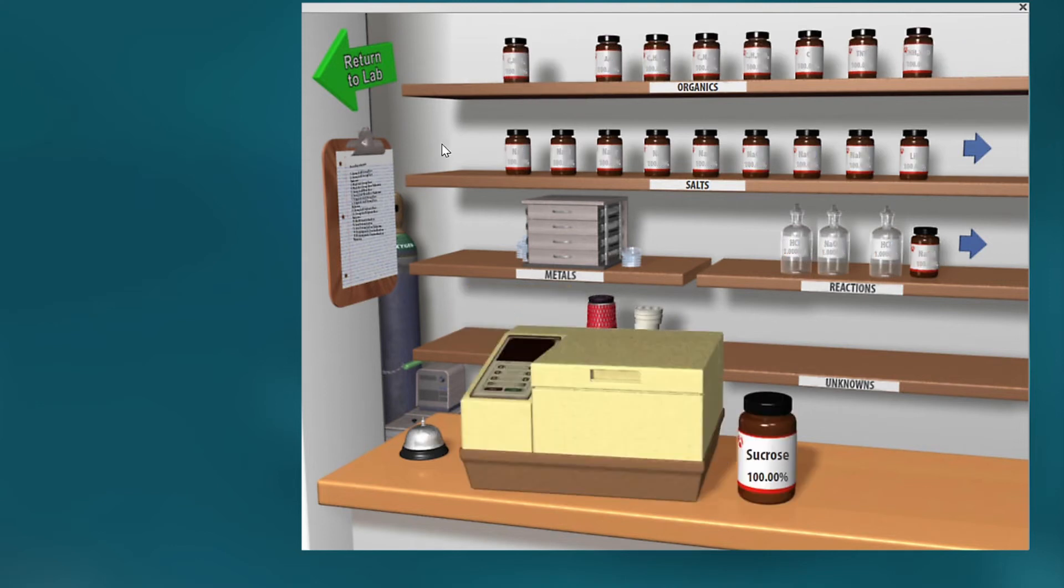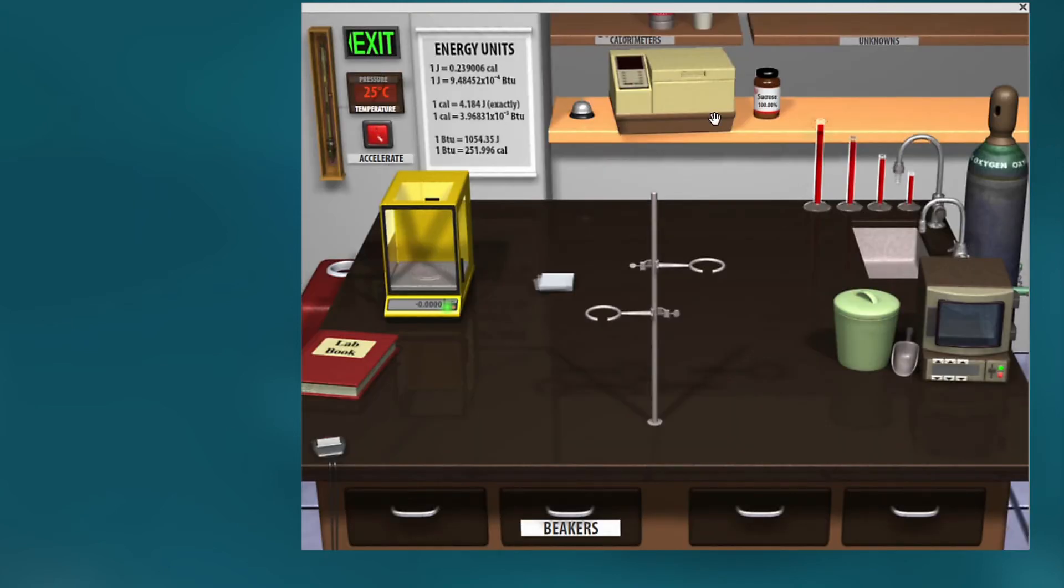There's our sugar and our calorimeter. Put them into position.